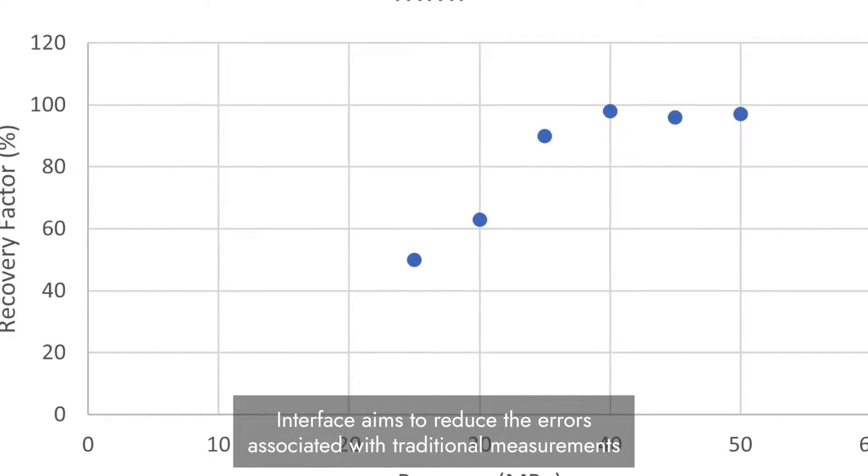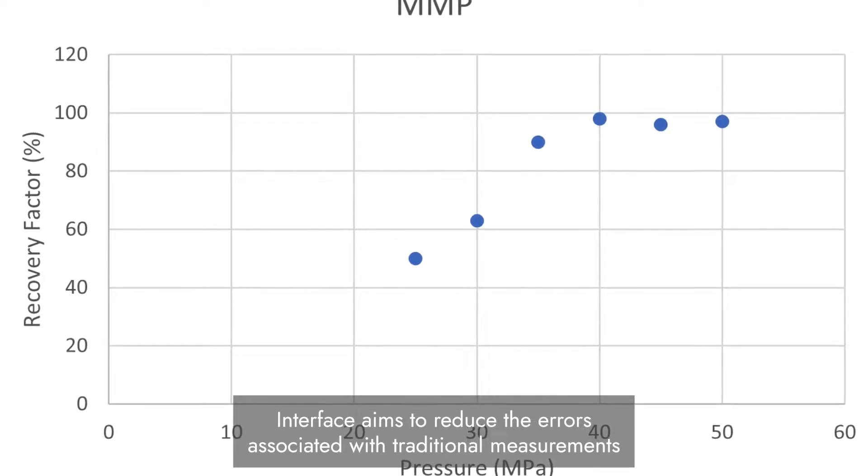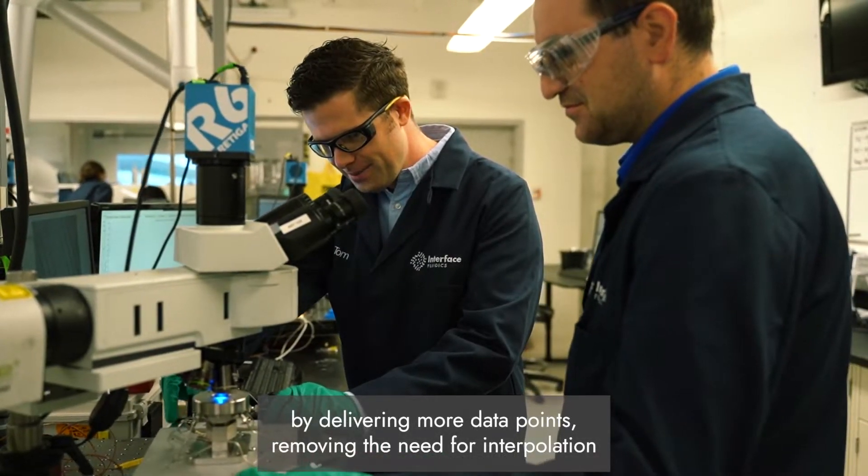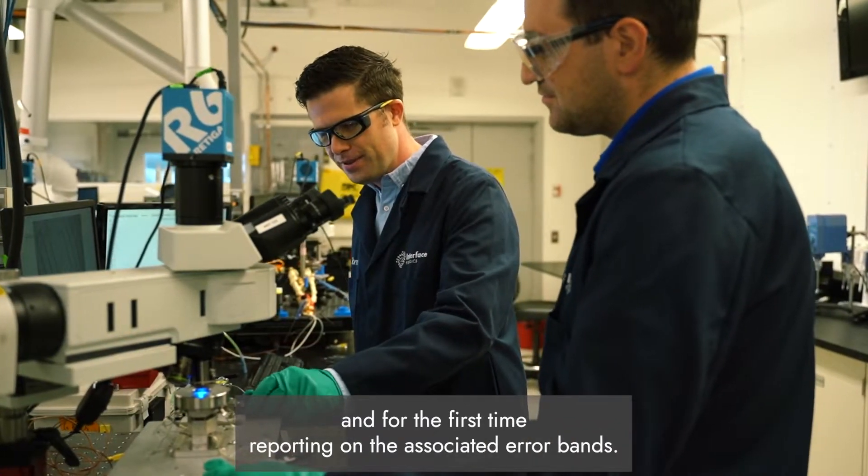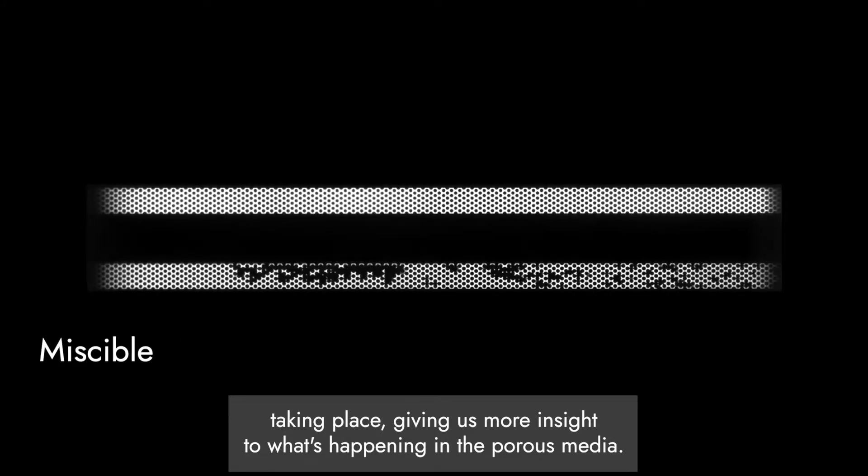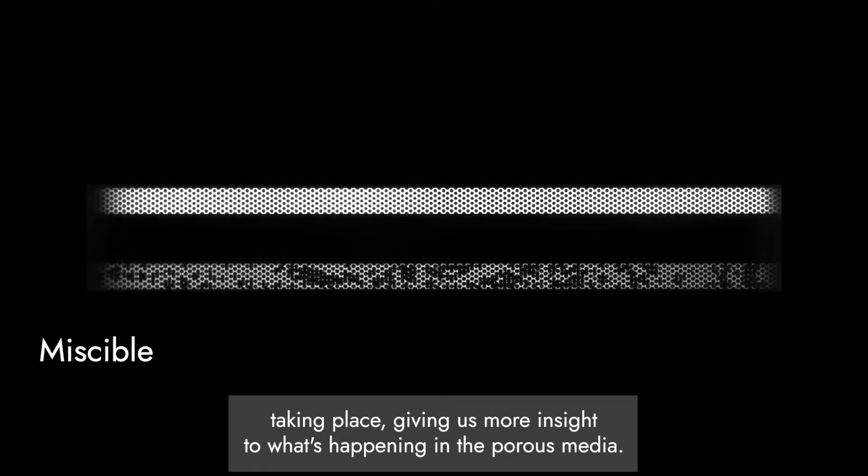Interface aims to reduce the errors associated with traditional measurements by delivering more data points, removing the need for interpolation, and, for the first time, reporting on the associated error bands. This process also provides visual access to the gas-oil interactions taking place, giving us more insight to what's happening in the porous media.